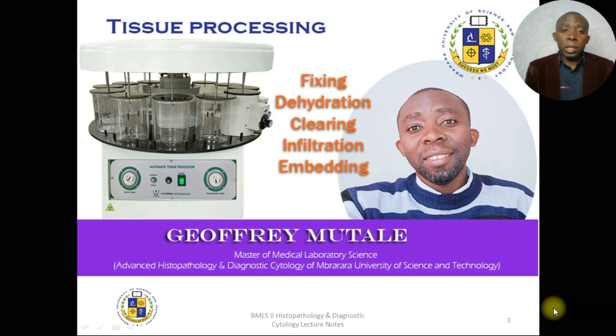So for today's presentation, we are going to be discussing tissue processing. Yes, we have talked about tissues in the previous presentations, and today we need to look at what we mean by tissue processing.